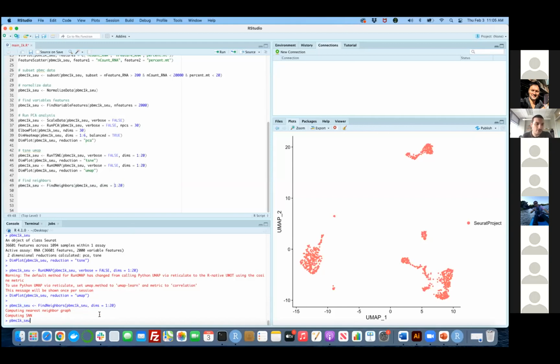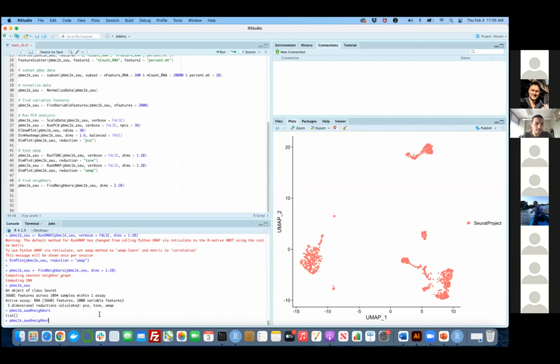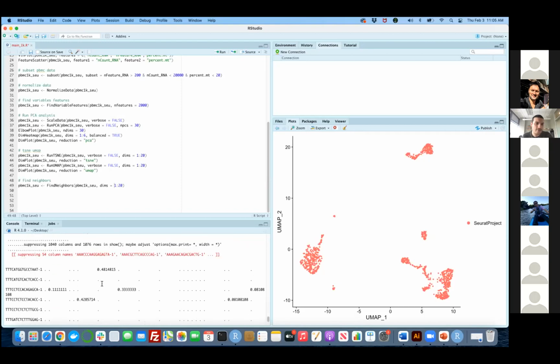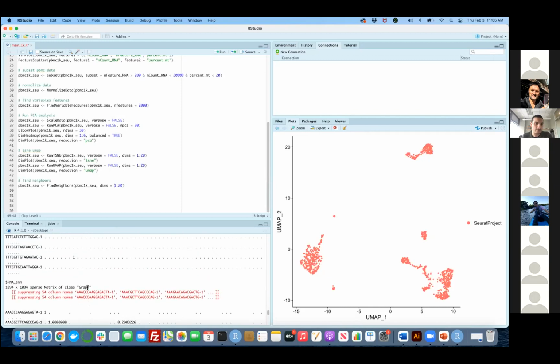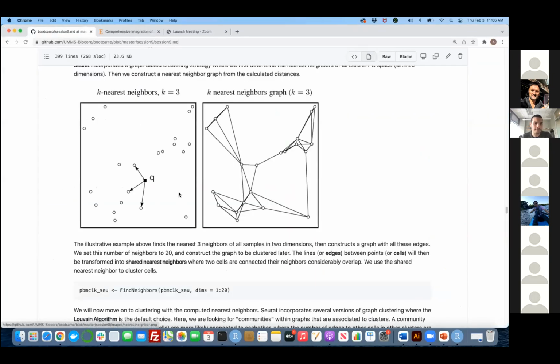So you can take a look at this object. You can just say neighbors here. Oh, no, it's not here. So I have to go to the obsp. Should be somewhere here. Not yet, maybe. I was pretty sure it was here. Yeah, the graph, yes. So it actually tells you that it has some distance between them and the neighbors are found. So it keeps populating the data as you have more graphs and more data in it.